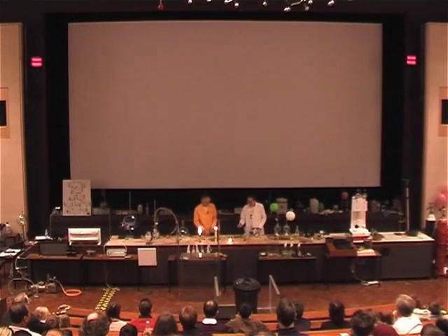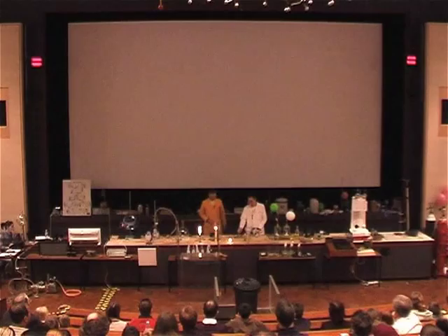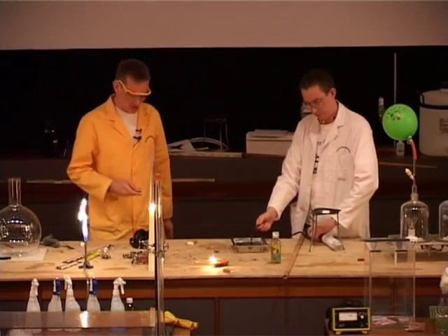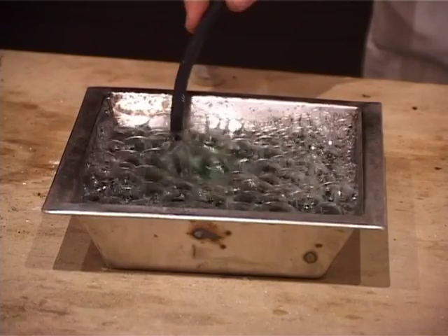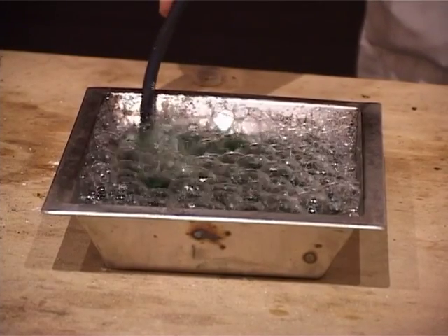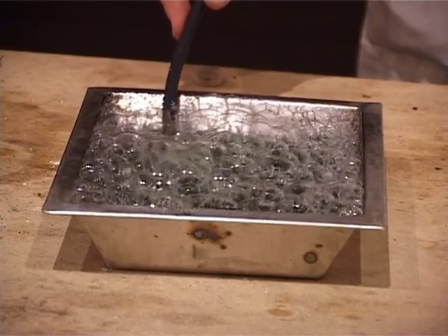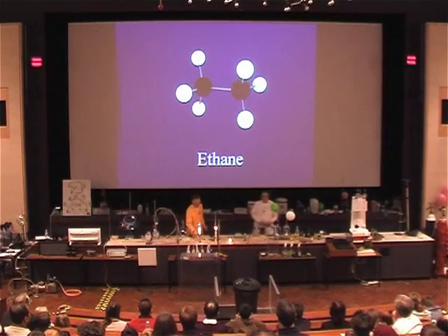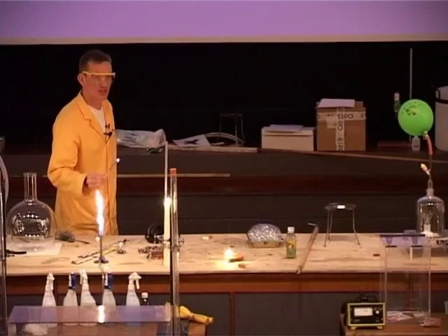Now we're going to burn some other fuels here, some other hydrocarbons. First of all we're going to start with a gas very similar to the methane in the Bunsen burner here. This gas is called ethane, and this consists of two carbons and six hydrogens.